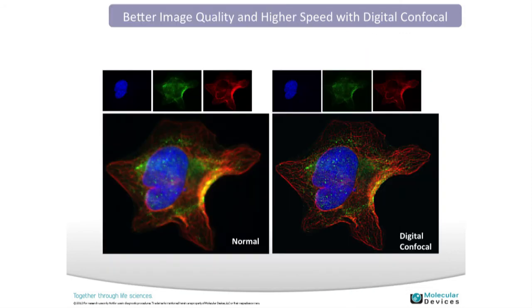I mentioned digital confocal earlier. With 3D data sets or images with a lot of out-of-focus light, we can remove that in post-processing with 3D deconvolution, and we can also remove it during acquisition. On the left is an image taken normally without deconvolution, and on the right these structures are much more in focus with higher contrast. An added benefit is being able to use a shorter exposure time, which is a benefit for throughput.